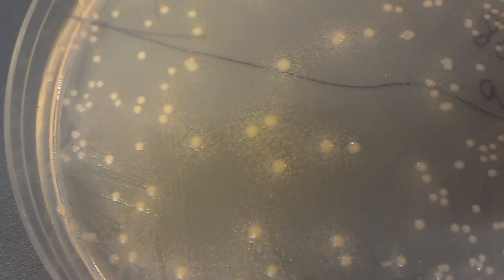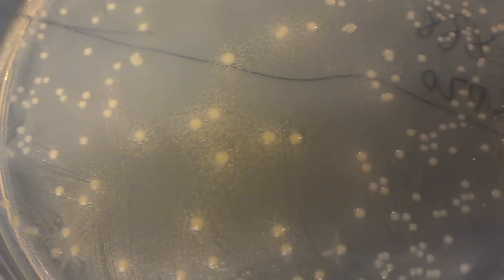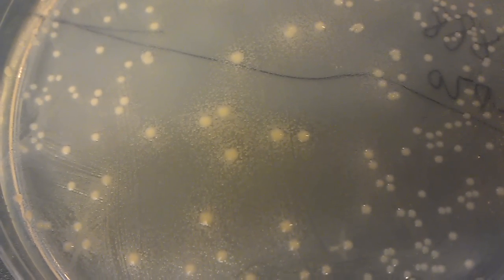So don't pick satellite colonies if you can help it. Part of the reason for getting these satellite colonies is because your ampicillin concentration has gone downhill. So ampicillin is both heat sensitive and light sensitive. So if you're pouring your own plates, you need to make sure that your LB is very, very cool before you're pouring it.